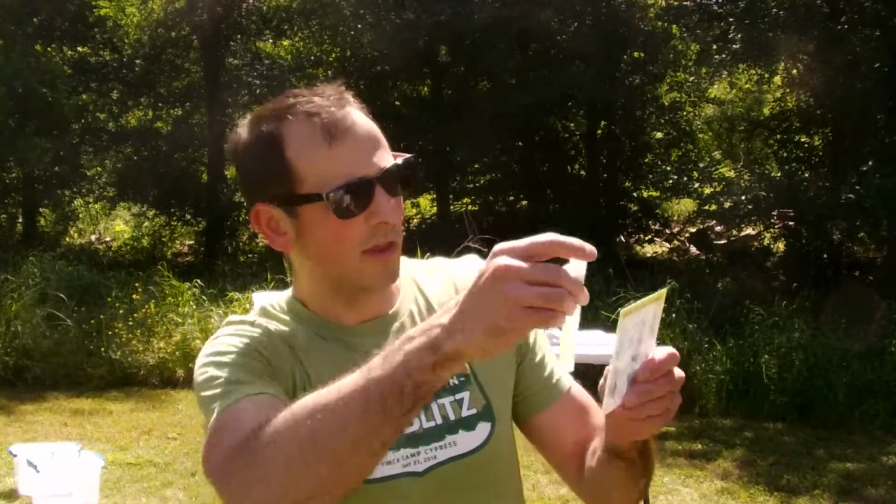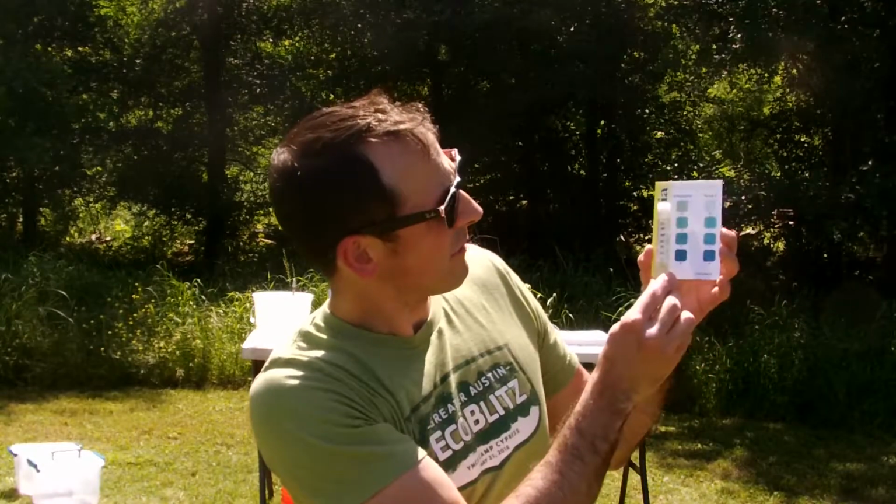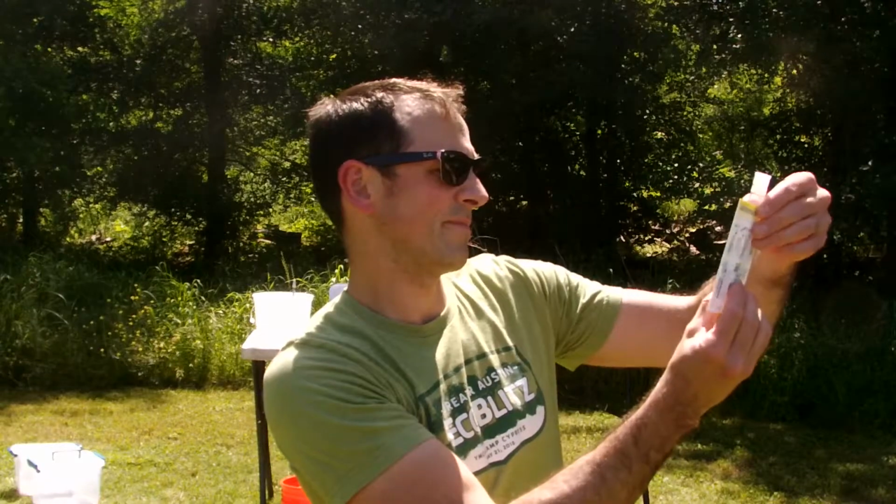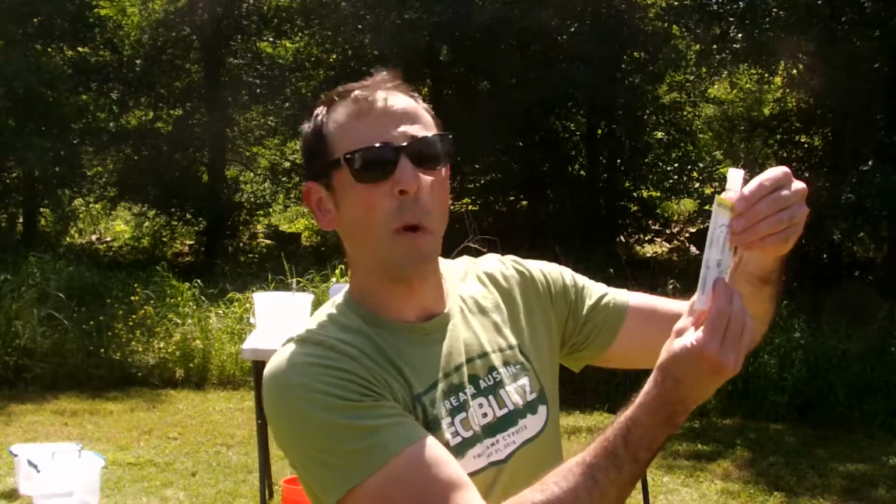Alright. So once again, we're going to wait the full 5 minutes with our activity with kids, but just for video's sake, so you're not staring at me and my face for the next 5 minutes, or 3 minutes and 45 seconds, we'll go ahead and do our best to match it up. So remember, fresh water, labeled fresh. Let's take a look at it. What were we hoping for? Y'all remember? Less than about 1, right?